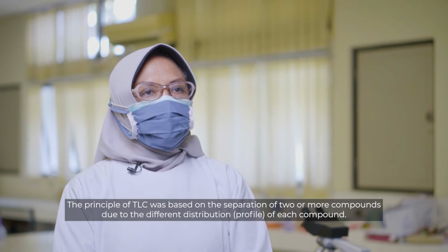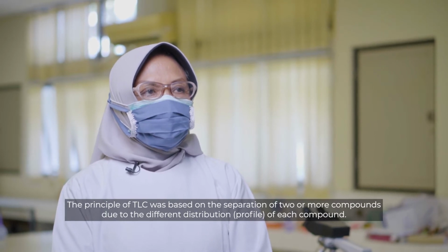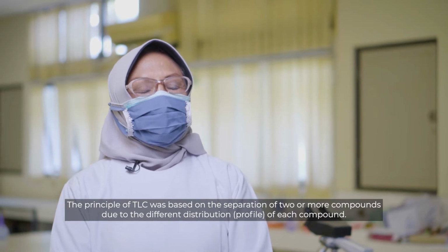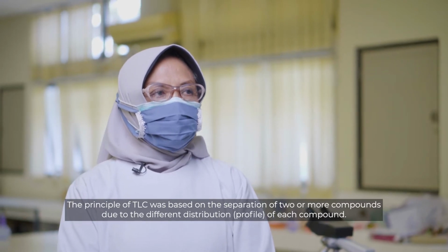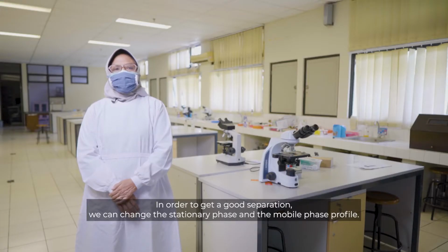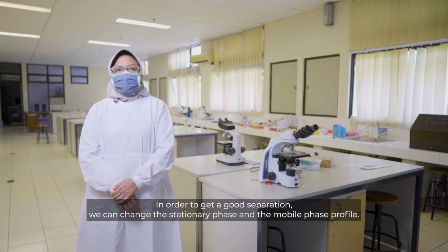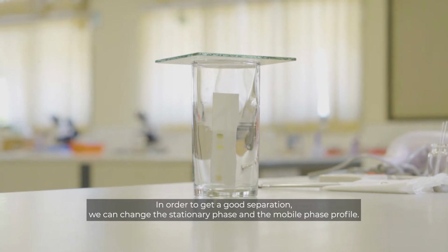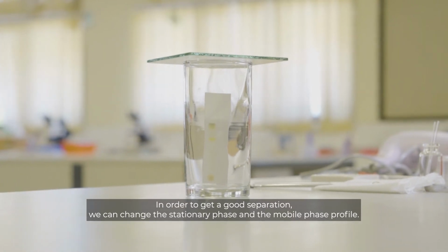The principle of TLC is based on the separation of two or more compounds by the different distribution of the compounds. In order to get good separation, we can change the stationary phase and also the mobile phase profile.